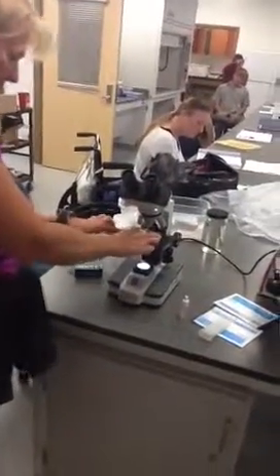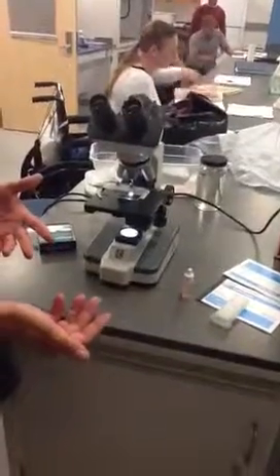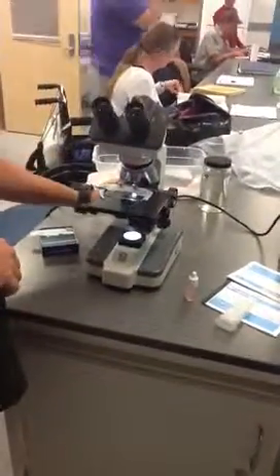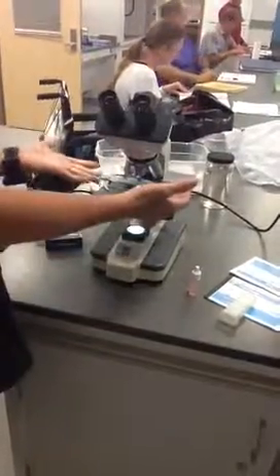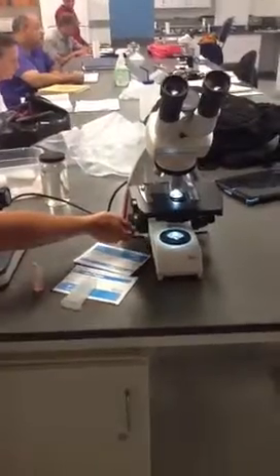All of our microscopes have four different lenses. When you start to focus on something you want to start on the shortest lens, which is the 4x magnification. All of them are par focal, which means once you get it focused under one lens it will be easier to find it and only fine adjustment is needed on the next lens. You always start with the stage all the way up. You've got your coarse focus, which is usually the larger knob, and the fine focus is the smaller knob — sometimes it's a separate knob.